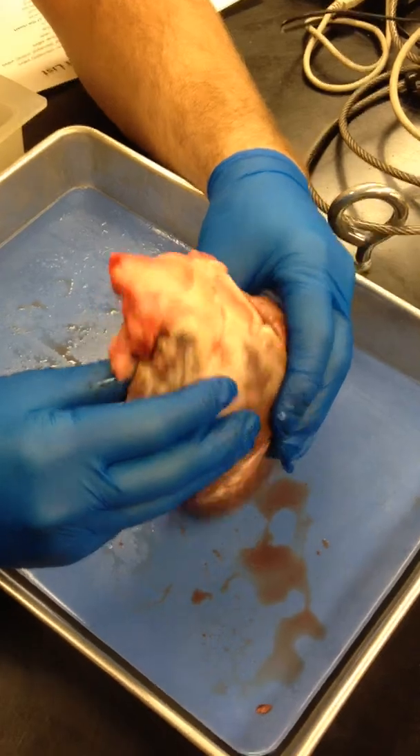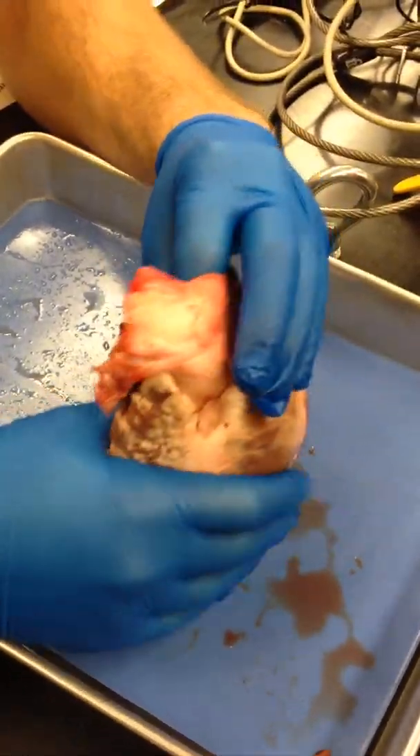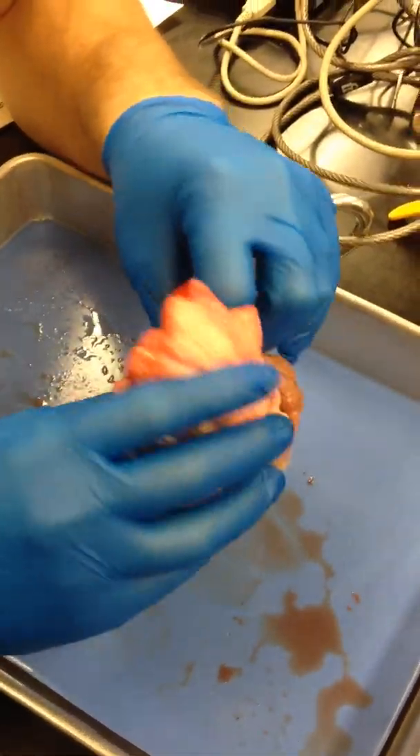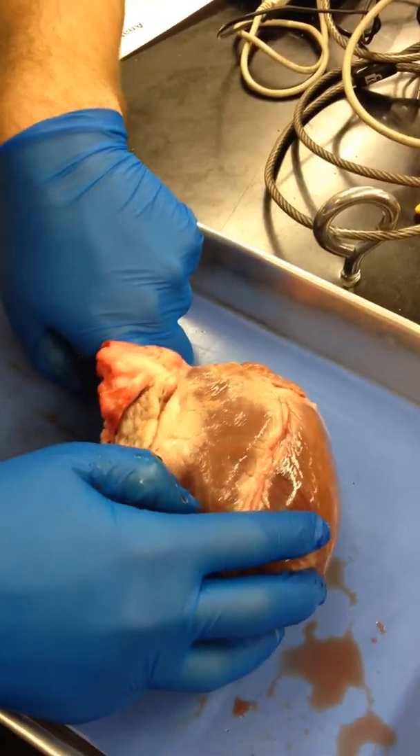And the body feels like my body. And we should be finding the aorta right here, which we do find the aorta. Right side, left side. And it goes right into that left side.